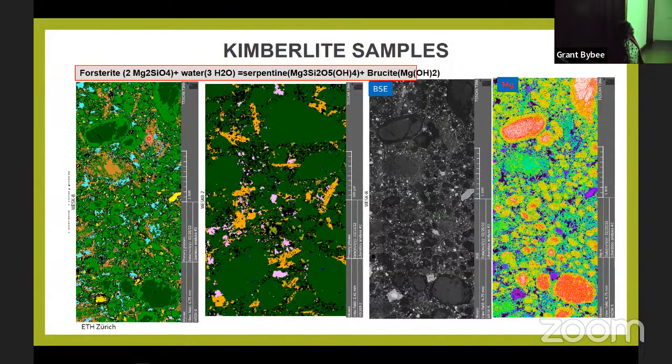I was working a lot with Rebecca here. And the initial product was this. You can see this and this are totally different, right? The TIMA says, as long as they're similar in chemistry, I'll give it one phase. Then you have to spend a lot of time doing the data reduction, making sure that this ultimately becomes this level.